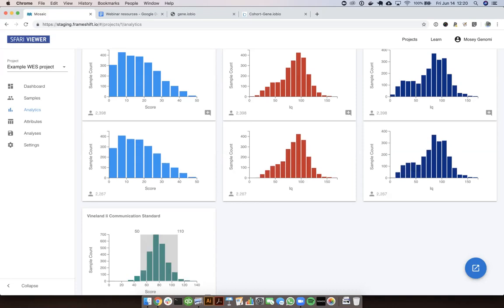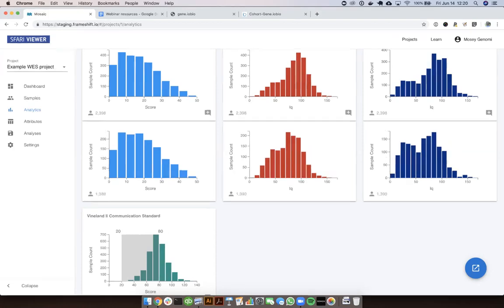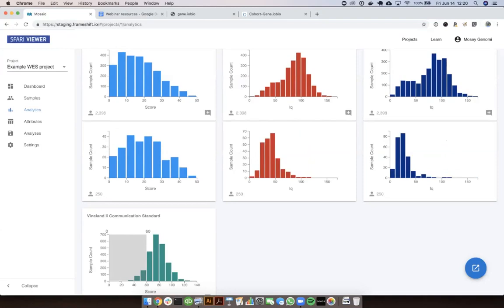And so given that I can choose any different metrics and play with them in any way like this, this lets me just look visually to find out if there are connections between different sets of data and maybe come up with some hypotheses that would lead me to want to have a more in-depth study to check these for statistical significance.